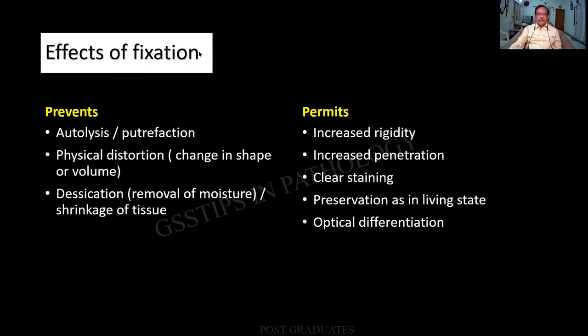Now, what are the effects of fixation? What does it prevent? What does it permit? Prevention means it prevents autolysis, it prevents heterolysis, it prevents putrefaction. Autolysis is the destruction by its own lysosomal enzymes, whereas heterolysis is by the infecting inflammatory cells or the bacteria. Putrefaction is superadded.